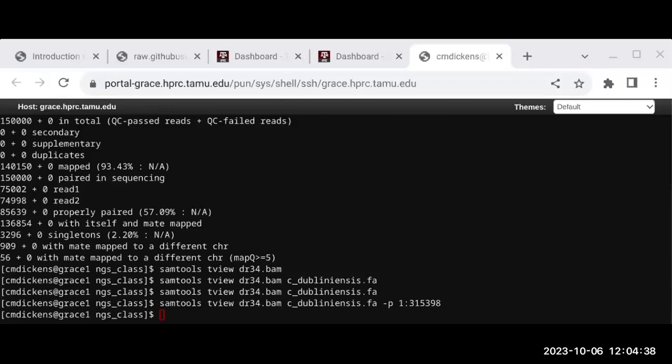RNA-seq. Lots of tools here. We have a lot of information. We have a lot of users that do RNA-seq. There are some packages in R and some software like Trinity. This is just saying which is better, to take more samples in the field or to take your sample and sequence it more times. Which do you think is better? It's actually better to take more samples in the field, more biological samples, than to take a single sample and sequence it 5 times.